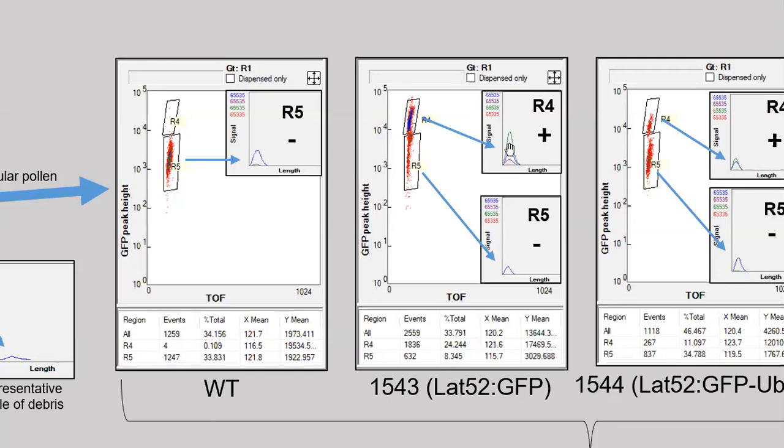And as you would expect, as it should, because it has higher green levels. If you sort something from this region, you don't see that green fluorescent peak. And so again, it is suggestive that the level of green expression is much lower down here.